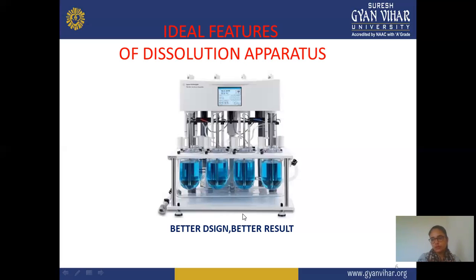That's why we select 37 degrees Celsius for this dissolution test; almost all types of dissolution require 37 degrees Celsius for testing. After setting this temperature, the rotation gets started, and the tablet disintegrates, or any type of formulation breaks, and slowly distributes in the buffer solution.